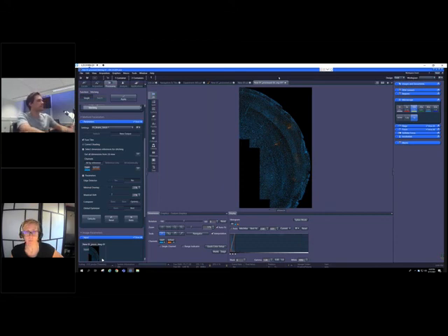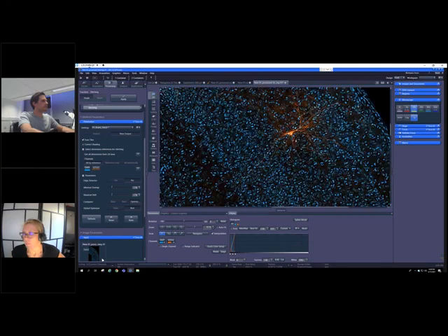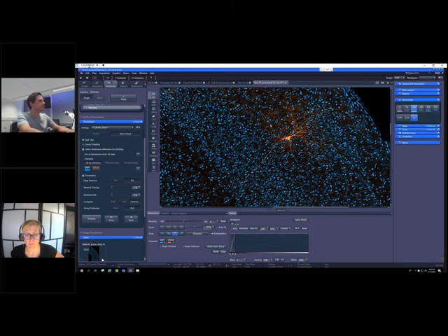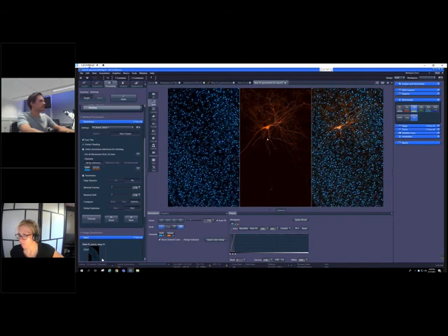And so here is the image that we generated in the experiment. I just did a quick stitching of our tile scan. This is what I was running here in the background on the left side. Let me just show this here in this split mode view. And as you can see, we removed a lot of background information in this image. We took a single plane. Of course, those processes are very much going into the tissue.